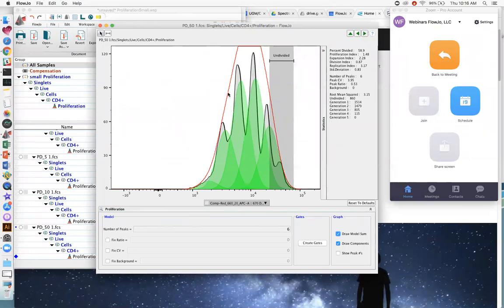Okay, and it's essentially the distance between this red line and the black line that the root mean squared is measuring. So the smaller this number is, the tighter the data fit the model. Okay, the larger it is, the further away it gets. So the idea is, with the constraints, we can try to bring this down.